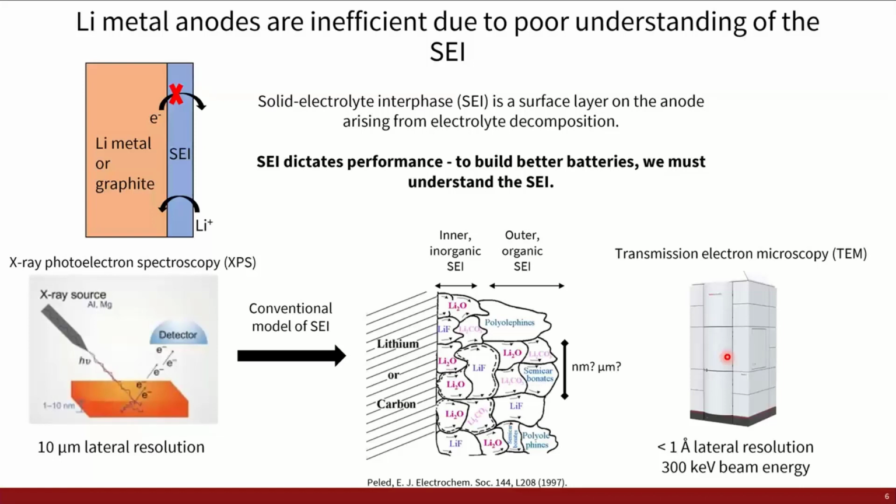While it might cost more money there, it's easier to get time compared to an X-ray beamline, which are commonly used for studies of cathode materials. So I see cryo-TEM as lying somewhere in between XPS or SEM, which most institutions do have, and a beamline, of which there are only probably a few dozen in the world.